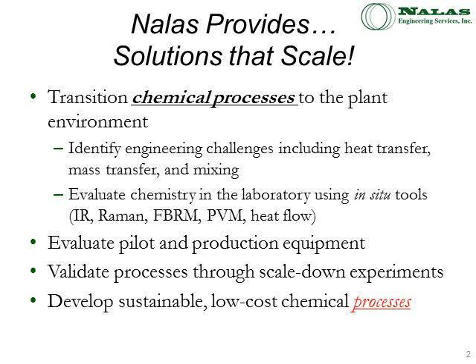mixing. What we'd like to do is use a variety of tools, including in situ IR, Raman, focus beam reflectance measurement, particle vision microscopy tools, and also heat flow. We take our processes and we evaluate them at the pilot and in production equipment using models. And we also use a variety of scale down experiments, which we're going to talk about and discuss some of the successes of using that approach today. Overall, we like to develop sustainable and low-cost chemical processes for our customers.